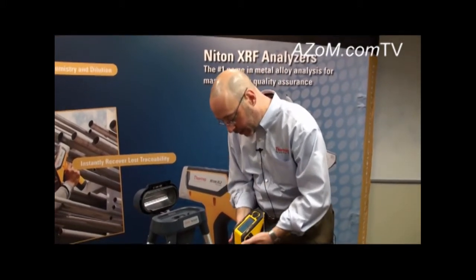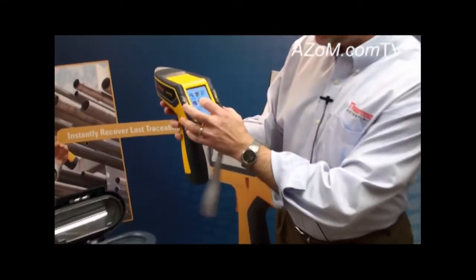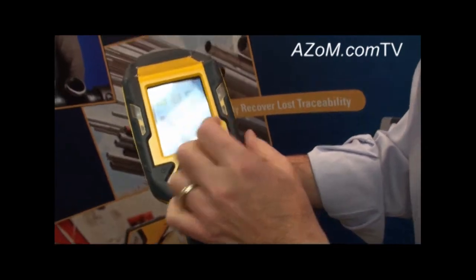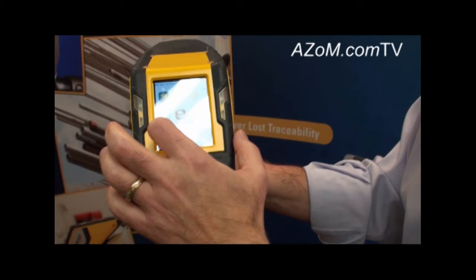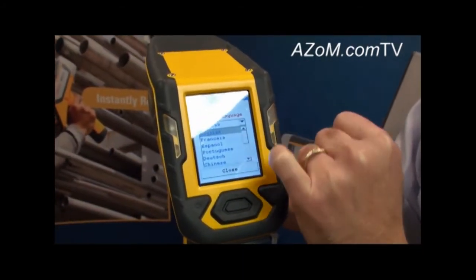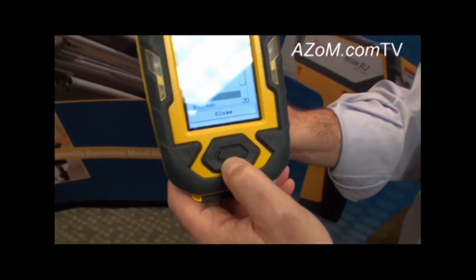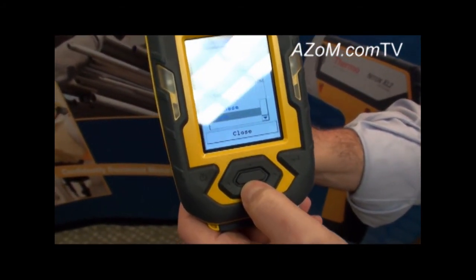The analyzer also caters for non-English speakers. It has on board the ability to support multiple languages. Coming into the system menu and clicking on language, users are presented with options for English, French, Spanish, Portuguese, German, Chinese, Korean, Italian, Japanese, and even Czech.